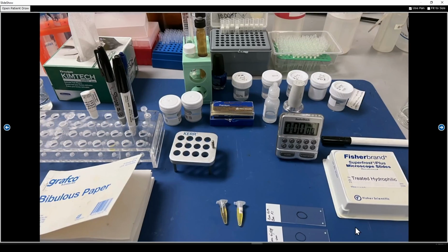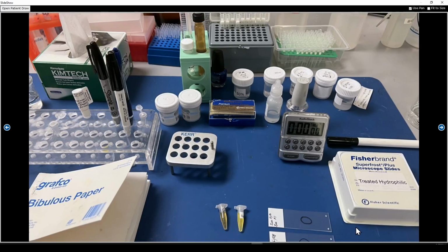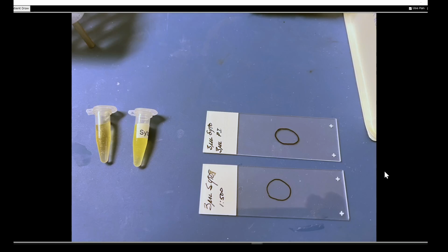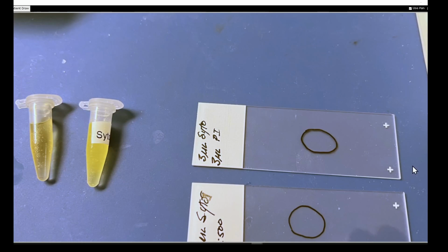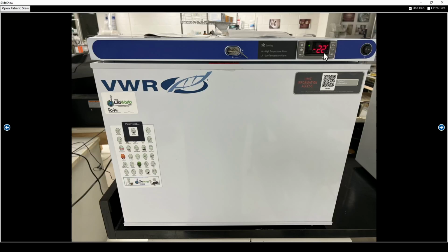So this is our staining station. It's actually a fairly simple procedure, fairly easy to understand. We put a biofilm sample on a slide and then stain it with these fluorescent dyes. In this case, we're using a live dead stain just as an example, so you can gain a sense of what this imaging is like.